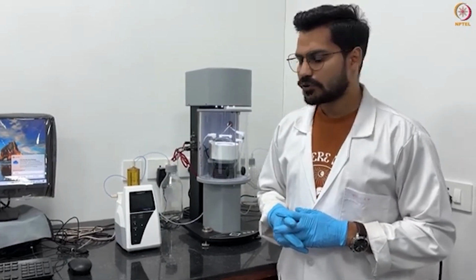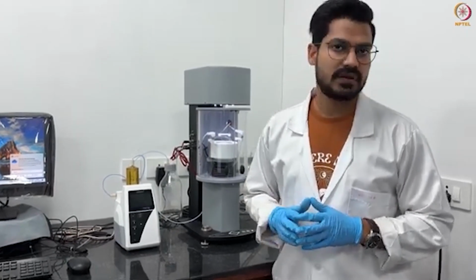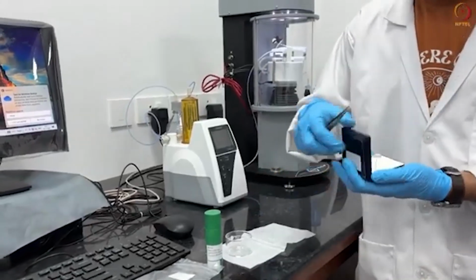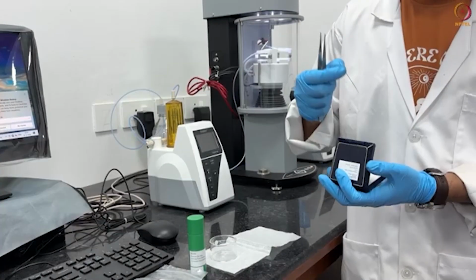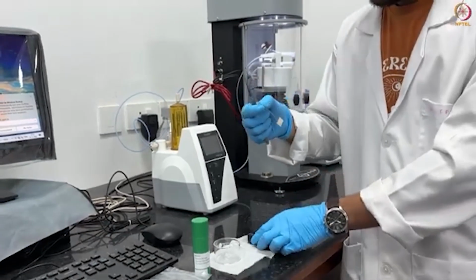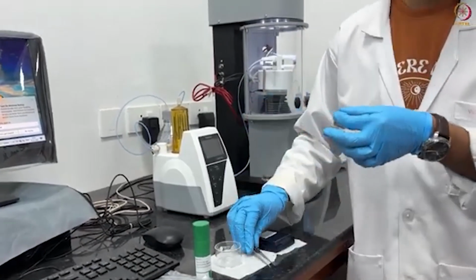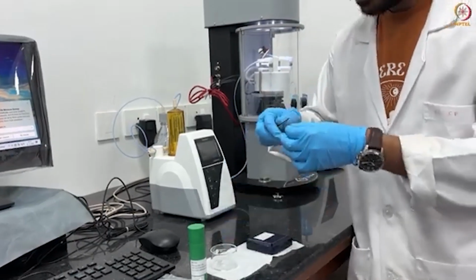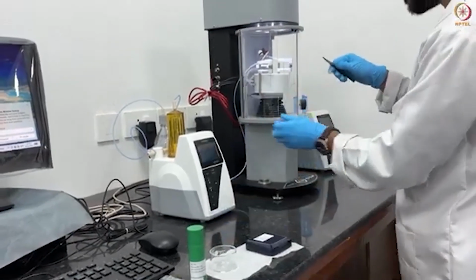First, let me show you the Wilhelmy plate and the ring type plates. Look how it looks. Now, this is our Wilhelmy plate made up of platinum. As you can see here, we have a separate cleaning procedure for this that I'll explain later. We can hang this Wilhelmy plate like this.